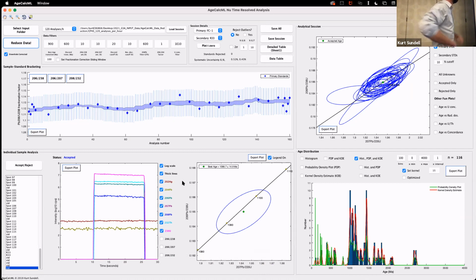Yeah, the first time you ever open one of these programs, what it does, so I've been told, is it finds the compiler on your computer, which is basically the engine. It's the runtime compiler that you downloaded. Everything has a runtime, like Java has a runtime. The engine that actually runs the program. And this engine is actually all of MATLAB. So it's a big engine. That's why the compiler took so long to download. But the first time it has to find that and then connect to it and navigate all this stuff, and it just doesn't show you that it's doing anything, for better or for worse. And so the second time it's usually a lot faster.